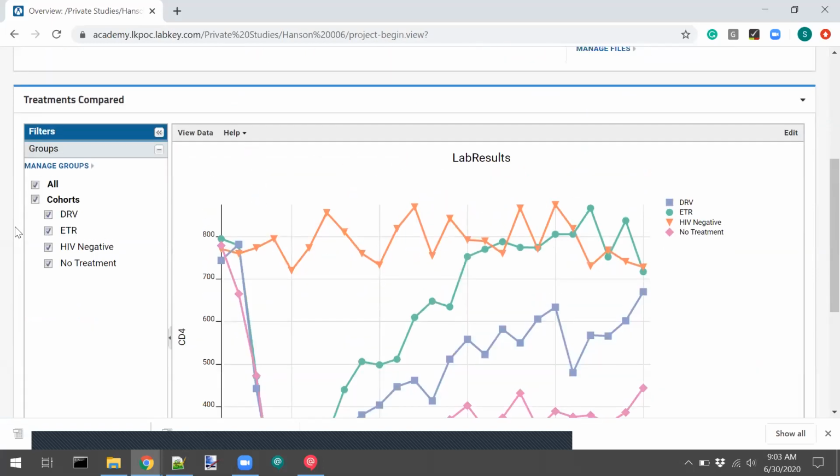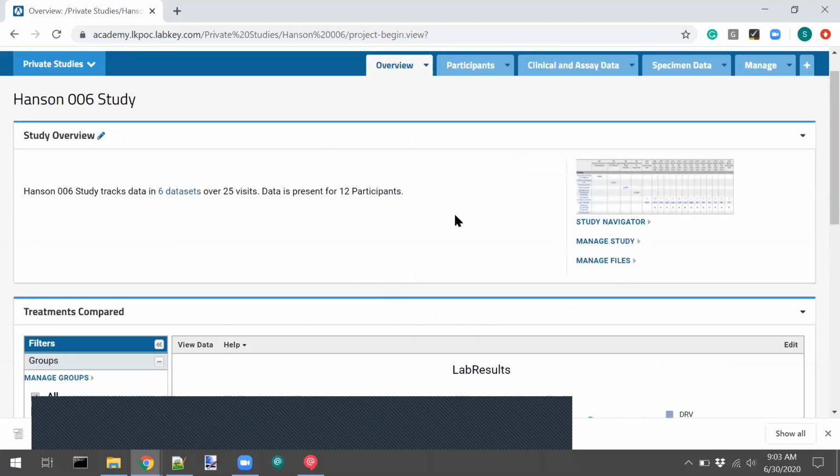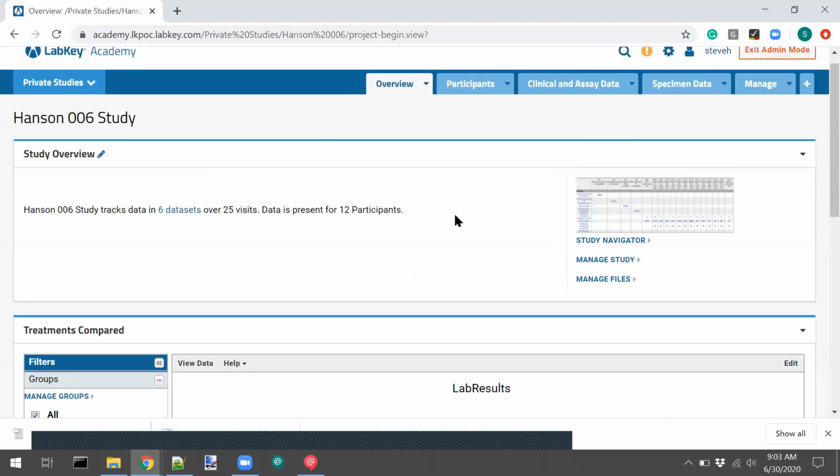So how long did that take me? 10 minutes, 15 minutes to get this far? I've already got something I want to show to the world. Let's start to do that. Questions before I keep going and change mode?